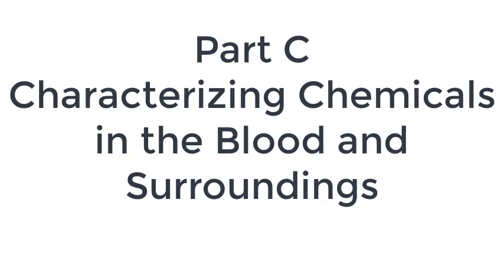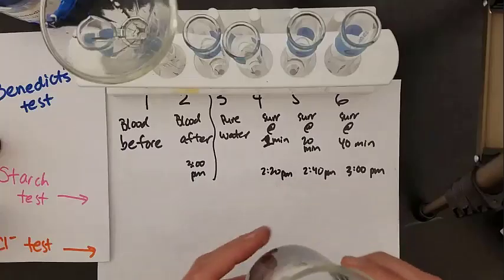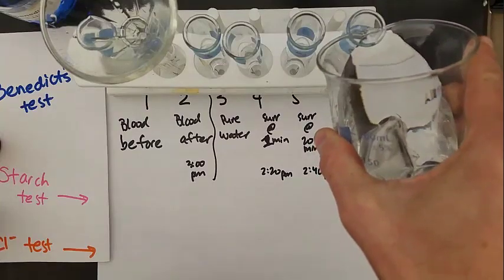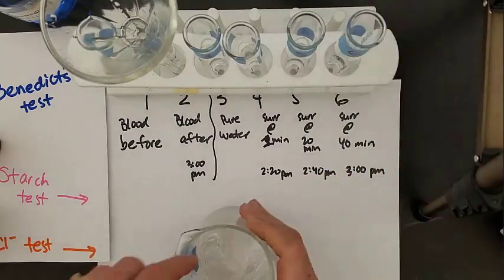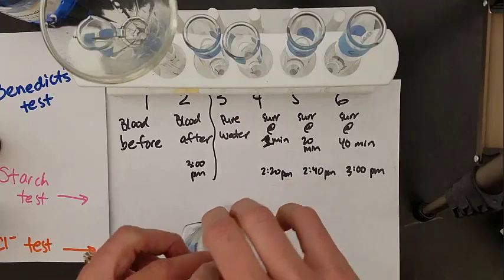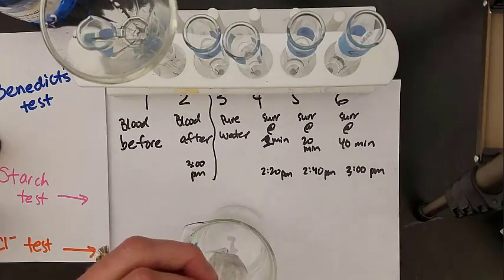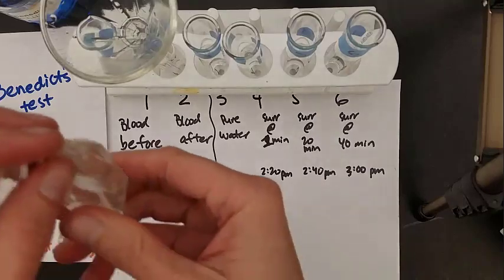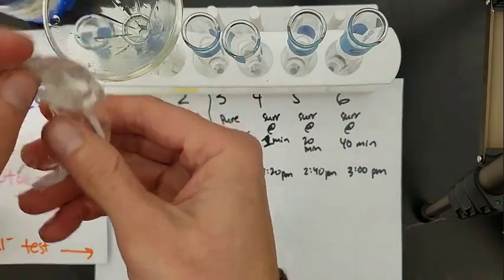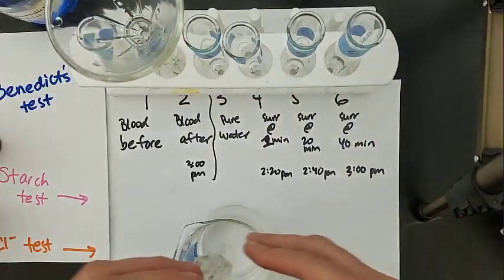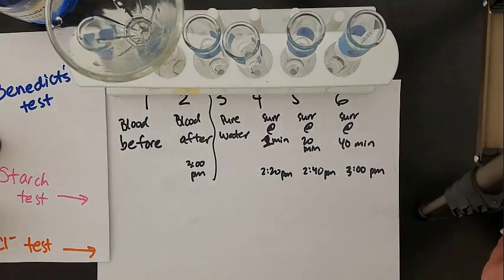Once the 40 minutes are done, we're ready to characterize the chemicals in the blood and surroundings. We'll pour the surrounding water into test tube six, that's our 40-minute surroundings. Then we'll cut open the dialysis tubing and pour that blood into test tube two, the blood after. So we have blood before in test tube one and blood after in test tube two.